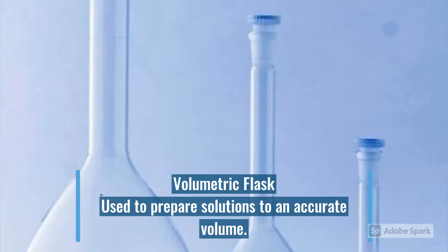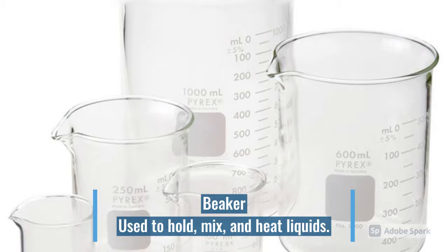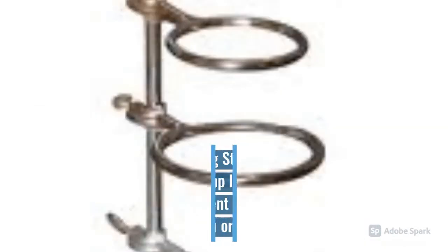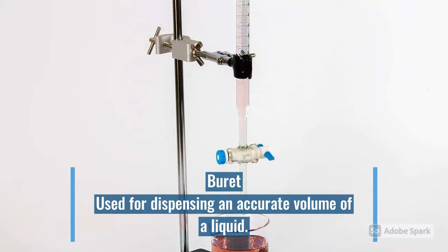There is also a volumetric flask, which is used to prepare solutions to an accurate volume. We also have a beaker, and this one is used for holding, mixing, and usually heating liquids. There is also a Bunsen burner, and this one is usually the heat source in the laboratory. A ring stand, which is used to hold or clamp laboratory glassware. Burette, this one is commonly used in titrations, used for dispensing an accurate volume of a liquid.